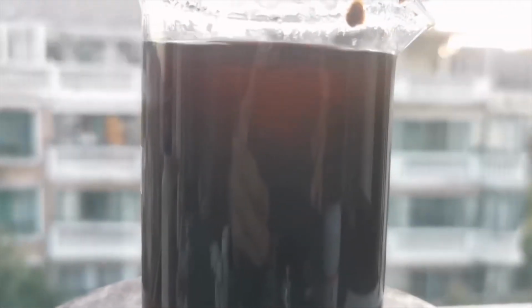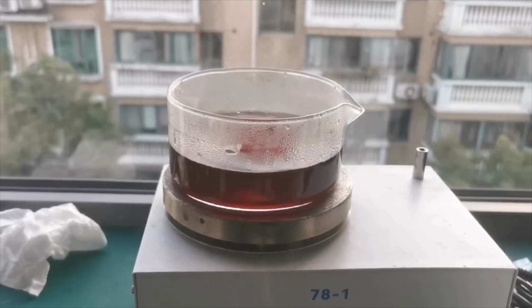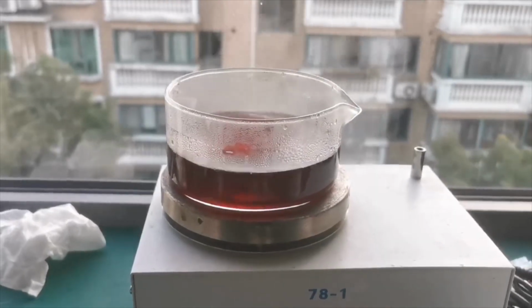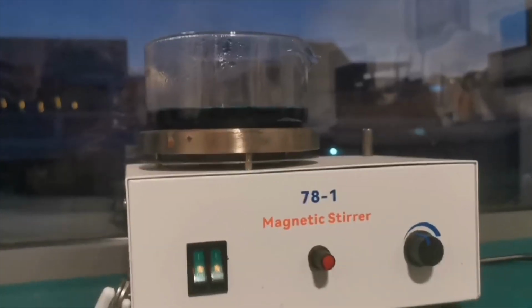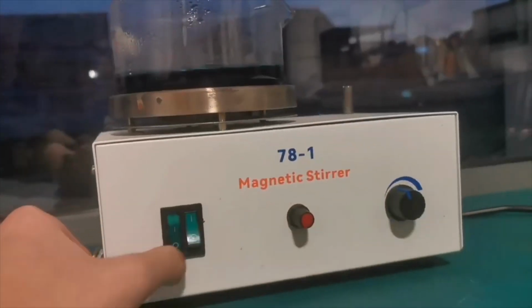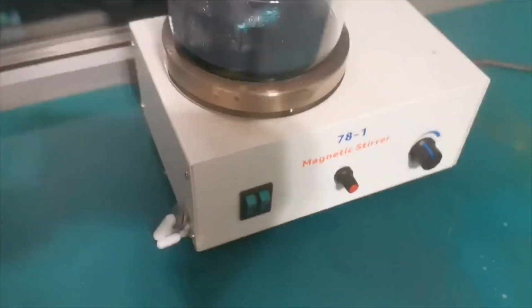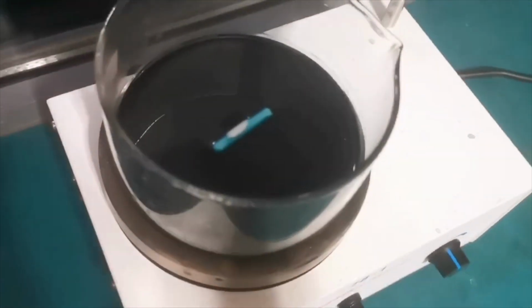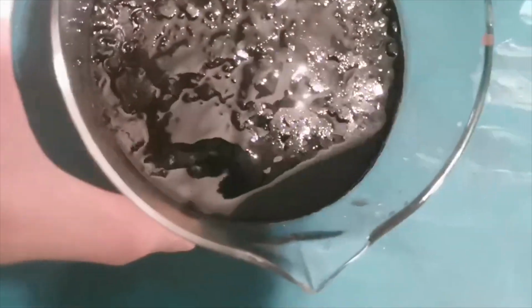Upon boiling it, all of the cobalt hydroxide dissolved, forming a dark red solution. The solution is then poured into a large crystallizing dish and evaporated. After an hour and a half, the solution turns to the familiar deep blue and its volume decreased by a lot. I removed it from heat and allowed it to crystallize. When the dish cooled, a large cake of nearly black crystals is formed.